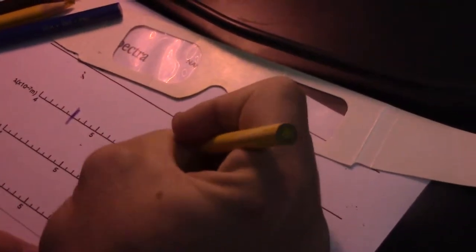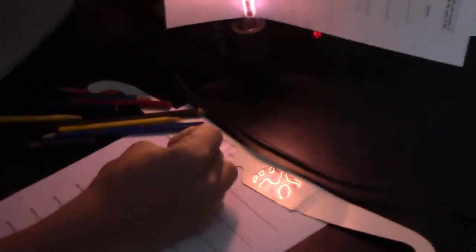So now we can go back... I see a yellow dead on 600, or dead on 6, should I say. And there's Sam making a yellow mark, and we can finish this out. There's a green at 520. And there's a red at... oh, where's this red at... good grief, it's very hard to see them here. There's a red at... looks like 640.